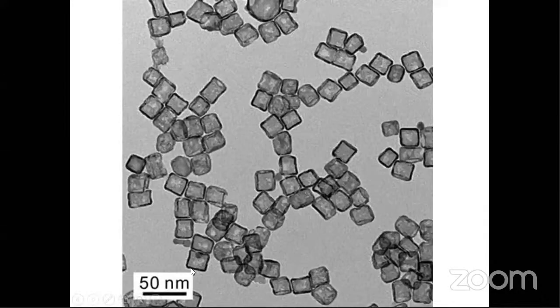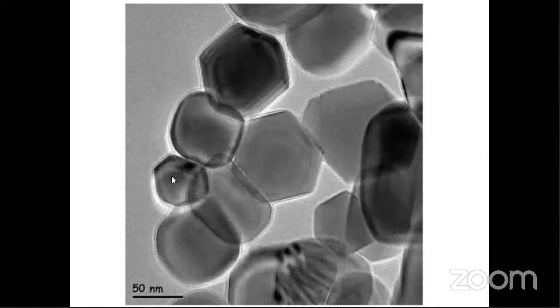Another sample. This is zinc oxide nanoparticles, transmission electron microscope of zinc oxide nanoparticles. Now, what is the beauty of TEM? You see that you can clearly see the crystal lying under this crystal also. This is a crystal sitting over this one. But if it is SEM, then you cannot see these inner portions. We can see only the upper part, so that this section should be blocked.